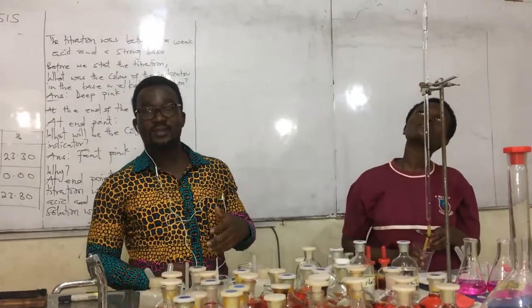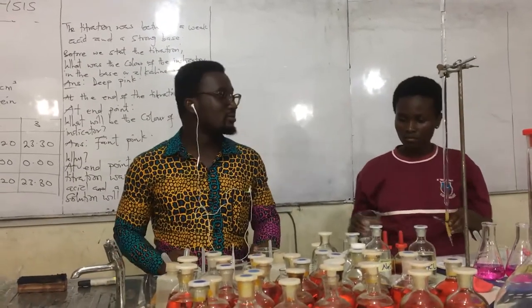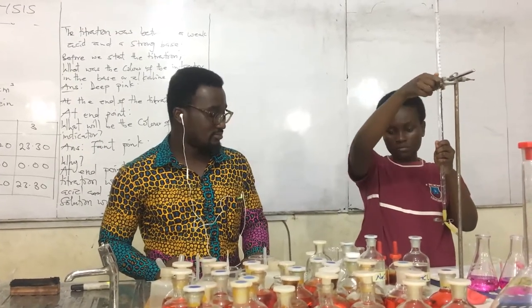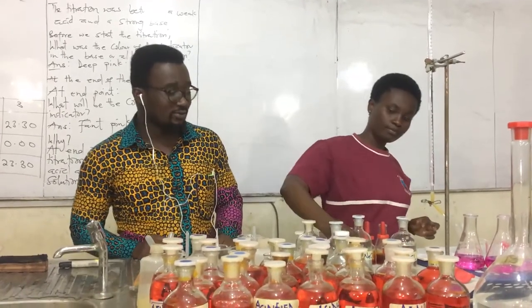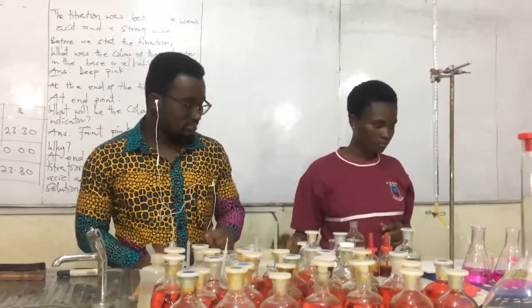She's still continuing with the same process, flushing out air bubbles to make the inside of the burette uniform. Okay, now she's going to continue with solution B.